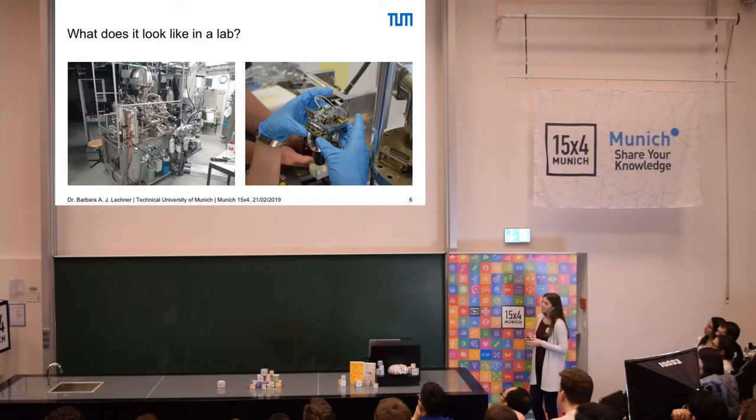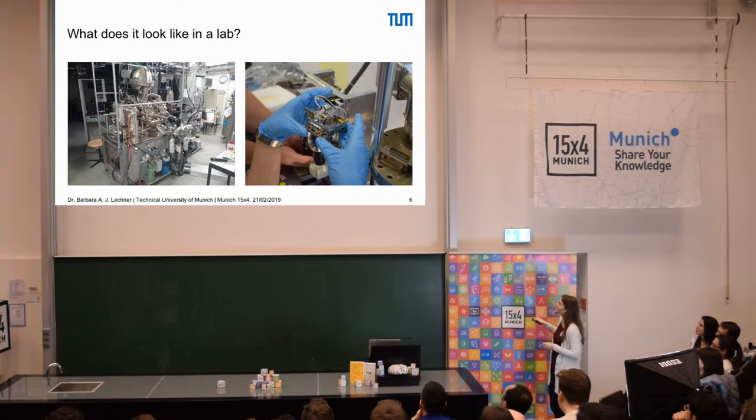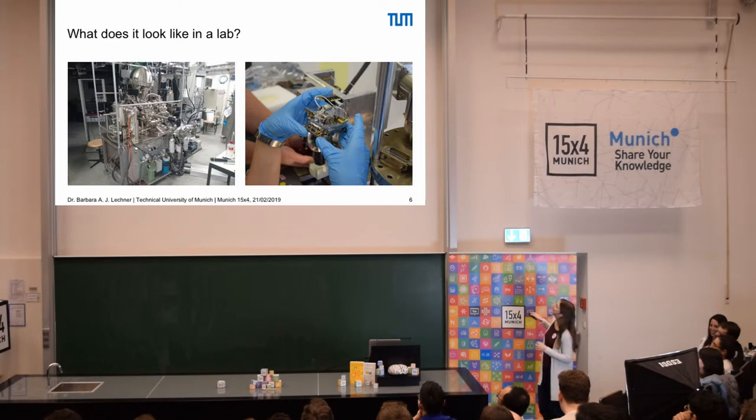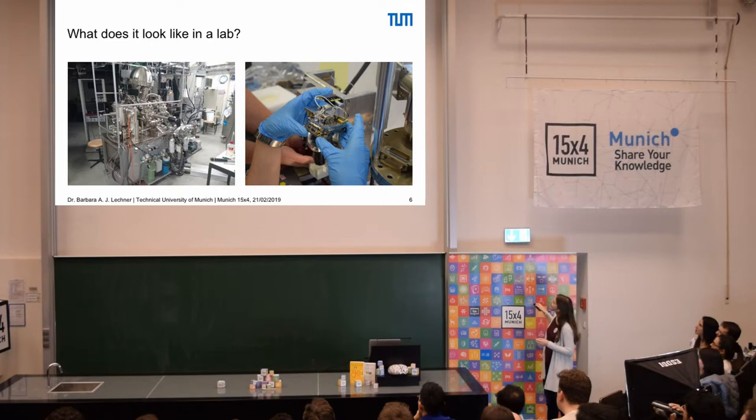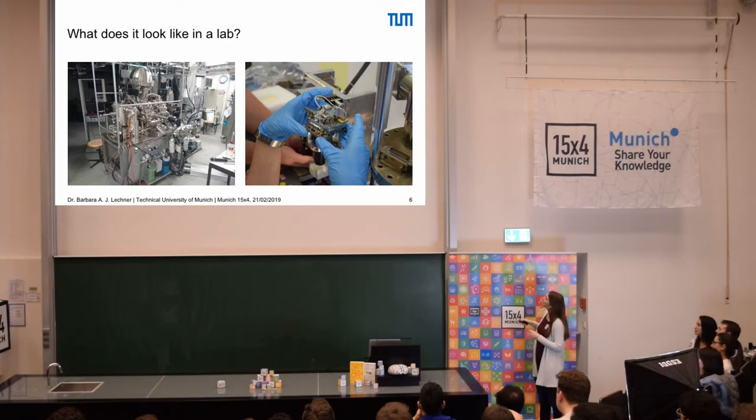This is what it looks like in our lab. So this is a really big machine, and most of this thing has nothing to do with the microscope. The surroundings are really just to have vacuum, to have controlled environments, and so on. So this whole big setup, it always looks a bit improvised, but it's actually highly sophisticated. And in here, just in this chamber, one tiny thing, if you take it out, so this is my colleague holding it, we had to repair it at one point. And this is a very fragile tiny thing, which is a microscope. And even here, the most part of what you see is just the motor, so these plates are what moves against each other. And the tip, you can't even see, it's so small, it's one tiny bit of wire with one atom at the end. So it's really a small piece.